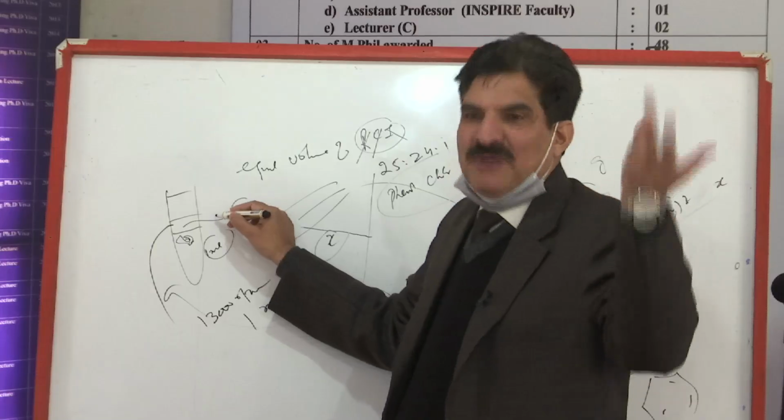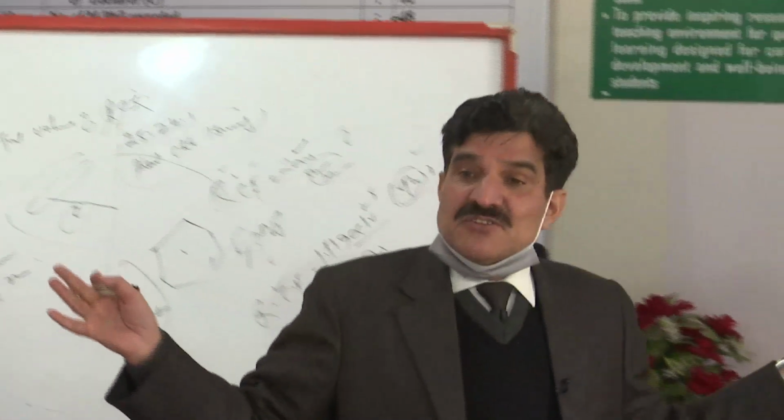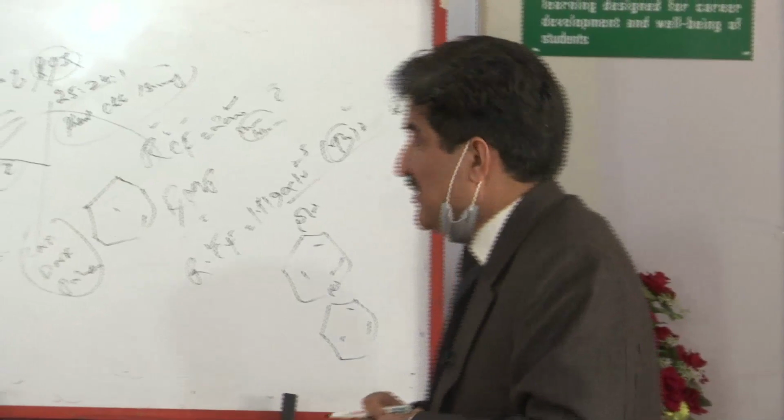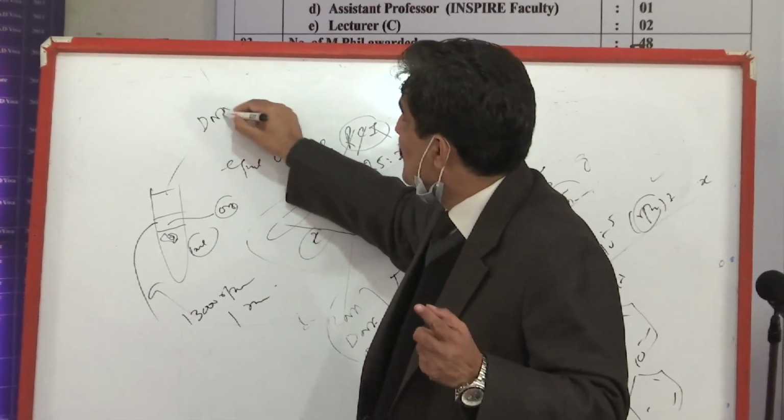One will be denatured proteins, the bulky one. Second will be your organic phase containing your RNA, etc. Any other thing also, it can be lipid also, because chloroform is not only for RNA, it is also dissolving lipids if they are present there. And the last one is containing your DNA.